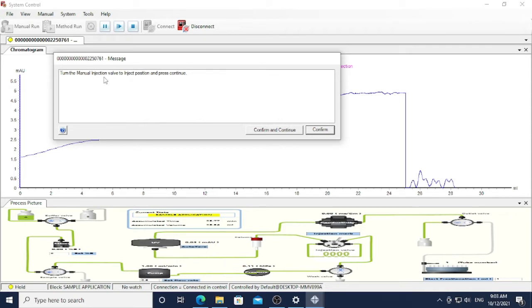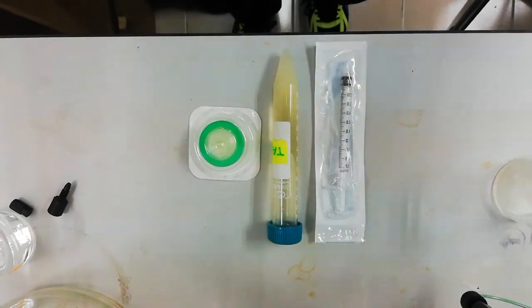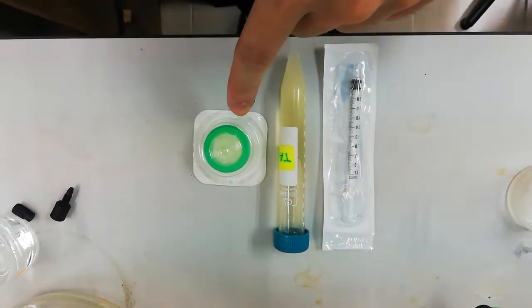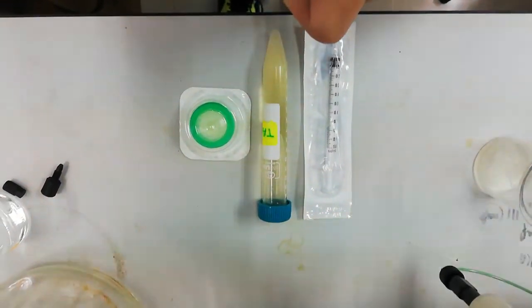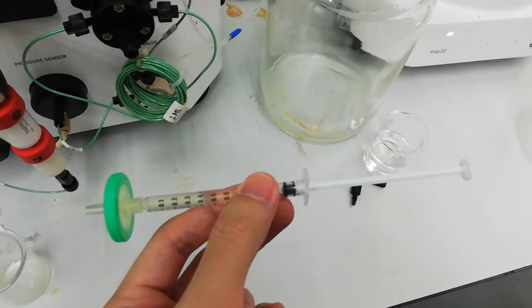The notification shows: 'Turn the manual injection valve to the inject position and press Continue,' which means you can now start injecting your sample and loading it into the system. Prepare your syringe and also your filter. Before injecting, prepare the syringe for the sample and also a nylon membrane filter. The purpose of the nylon membrane is to filter out unwanted material that will affect the chromatography. Suck up the sample into the syringe and connect the nylon filter to the syringe.